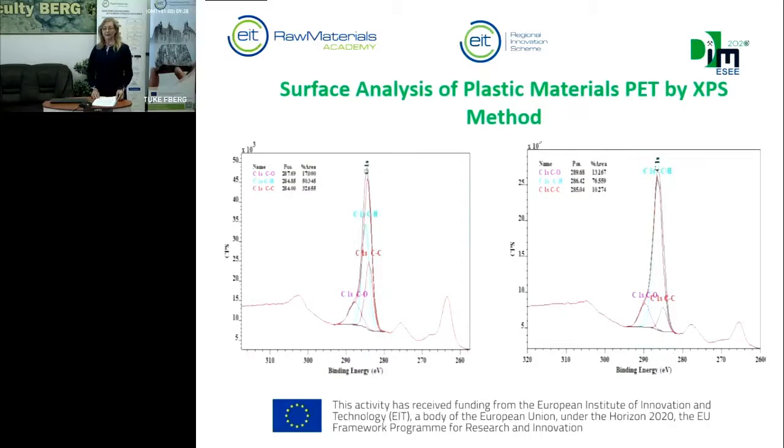By comparing energy spectra, we found that the hydrolysis by water with increasing temperature decreases the percentage of the carbon-oxygen bond, which is characteristic of an ester group, and at the same time increases the percentage of carbon-hydrogen bonds. These changes indicate a disruption of the structure of the polyethylene terephthalate.